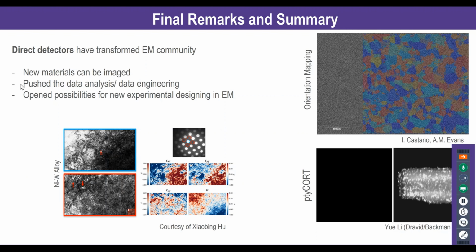And also one important factor here is that the community got much better in the last years at the data analysis and data engineering of these large data sets that are coming from these detectors, right? This is still in the early stage, I would say, but it's much better than it was a few years ago. There are codes around, freely available, and groups working on this, including Northwestern. And you're going to see much more of this in the future, and the community benefiting from this evolution, I would say.